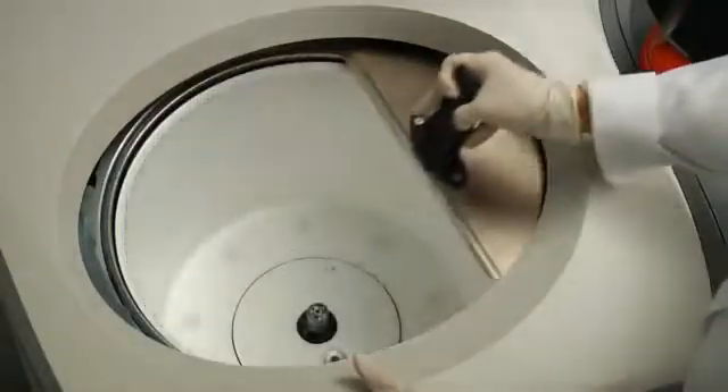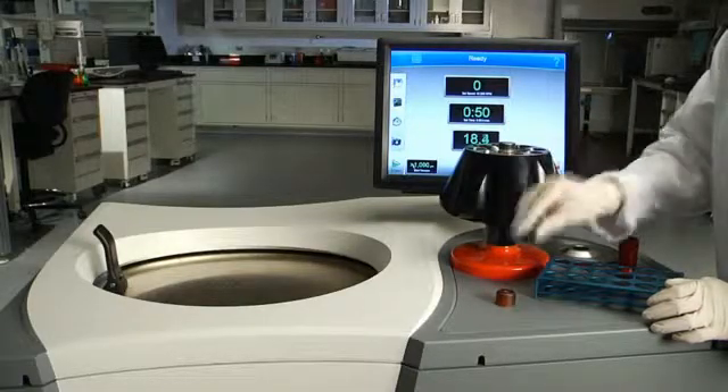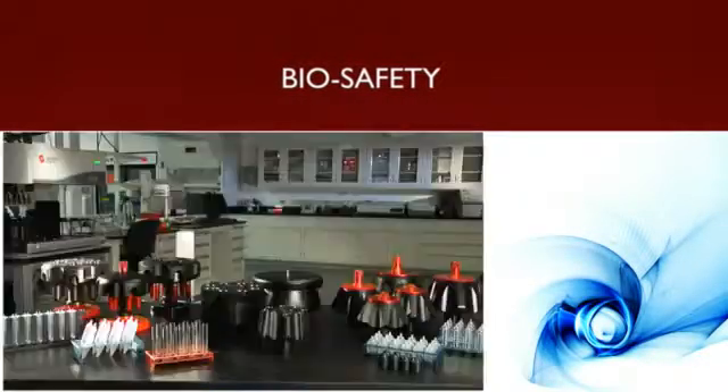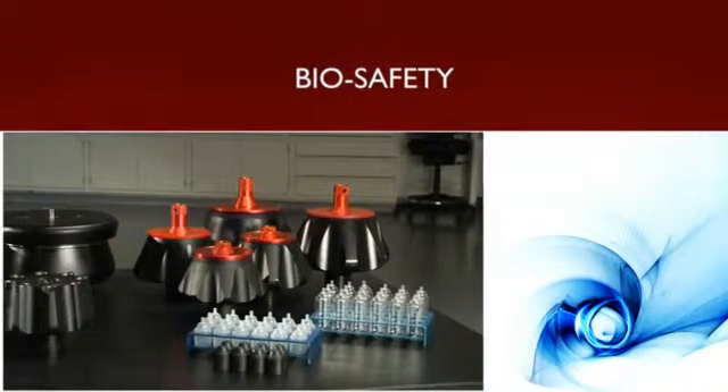all intended to keep you and your staff protected, your samples accurate, and our systems running smoothly. We manage biosafety in the lab with our innovative labware, rotors, and optional HEPA filter kits for optimal biocontainment.